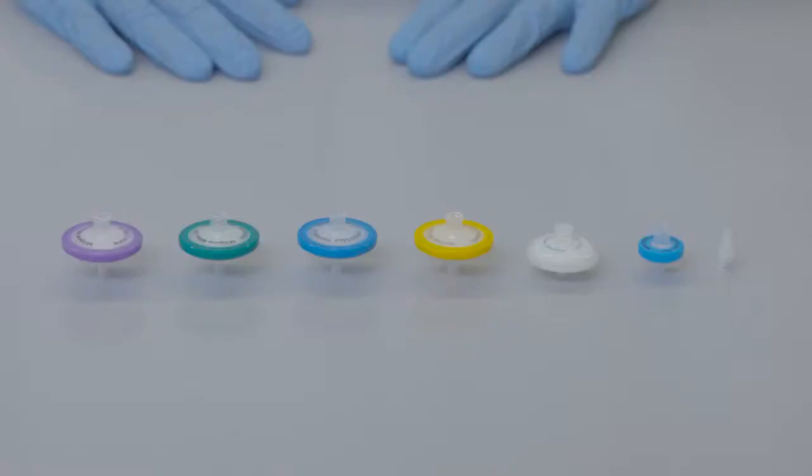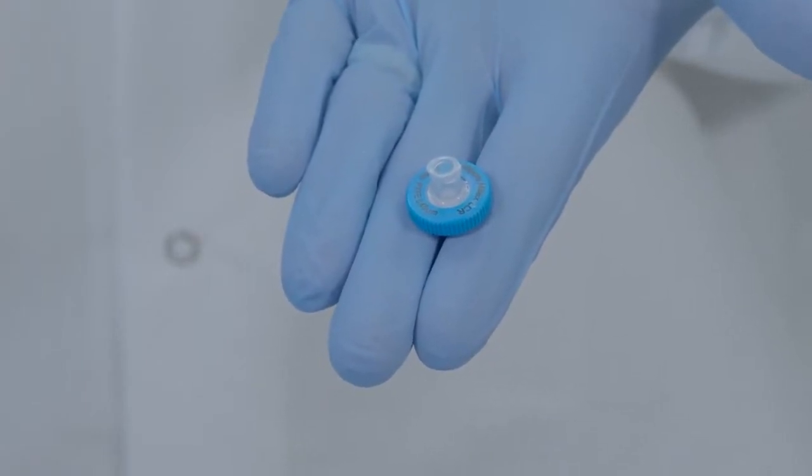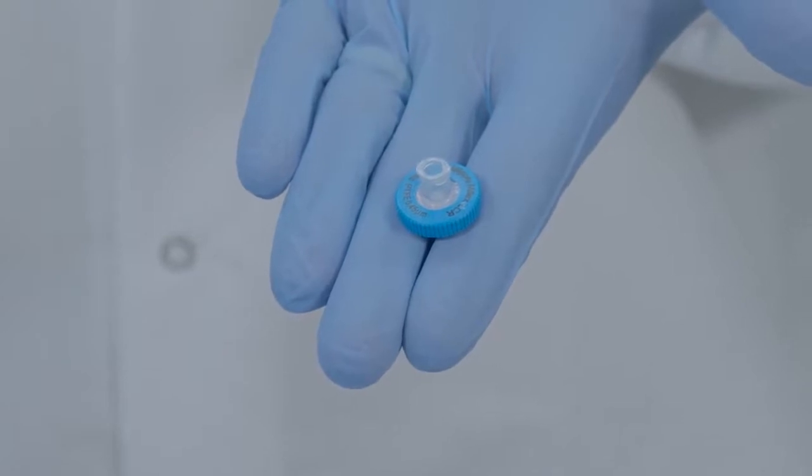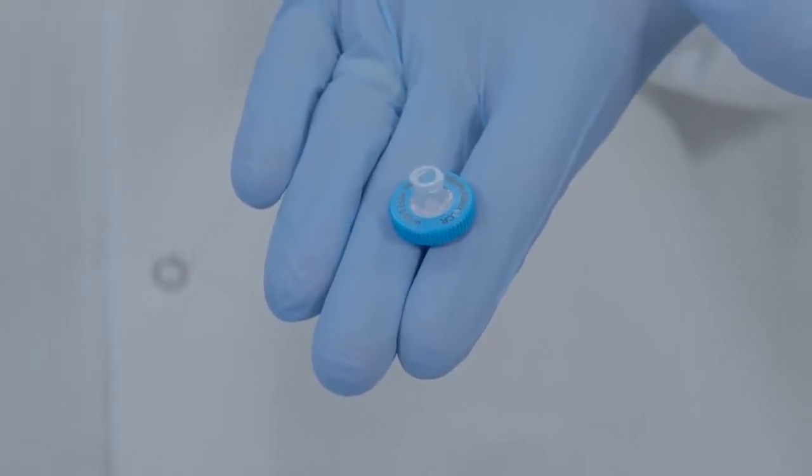Here are the reasons why some of these filters are bi-directional. 13mm overmolded syringe filters containing PVDF, hydrophilic PTFE, hydrophobic PTFE, or nylon membrane are bi-directional.